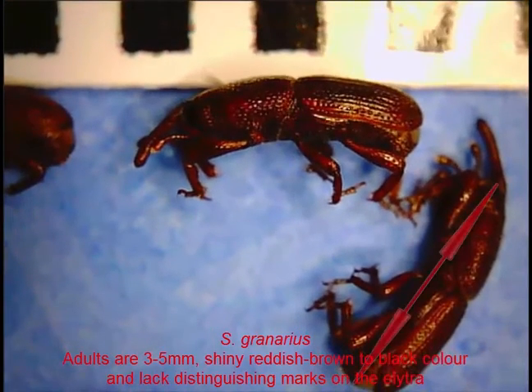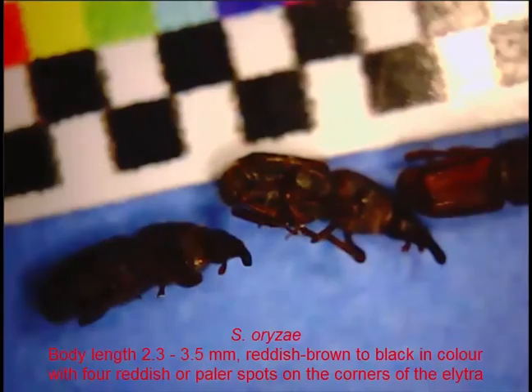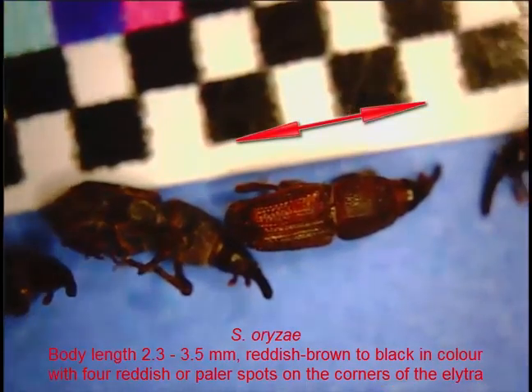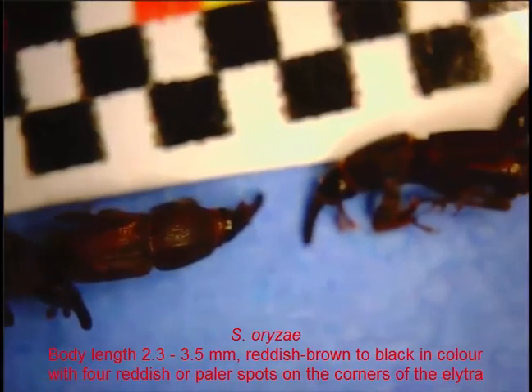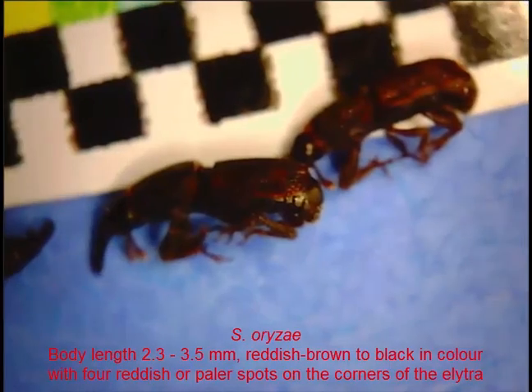Size is a pretty good differentiator for Sitophilus granarius, but the other two species, Oryzae and Zeamais, can be fairly similar in size. The smallest is usually Oryzae, which usually comes in at 2.3 to 3.5 millimetres. These specimens here are all under three millimetres.